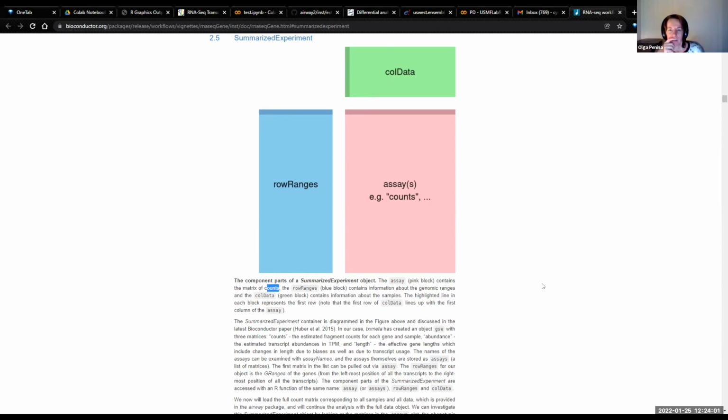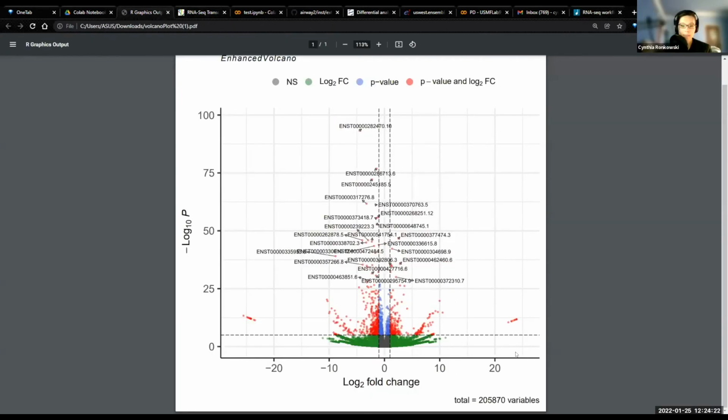Yes, so for these genes, how do you call this variable for fold, a double fold, or how is it called? Yes, I think I understood. So with the highest variance, yeah, I think they might actually be these dots over here. Yes, they will be here.